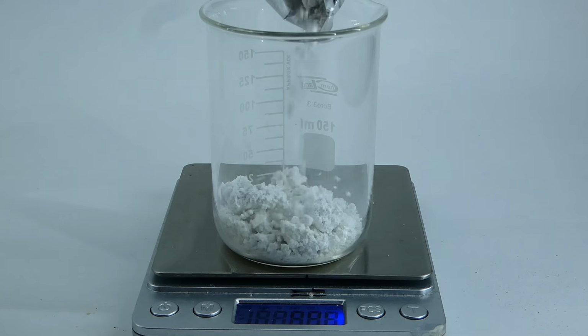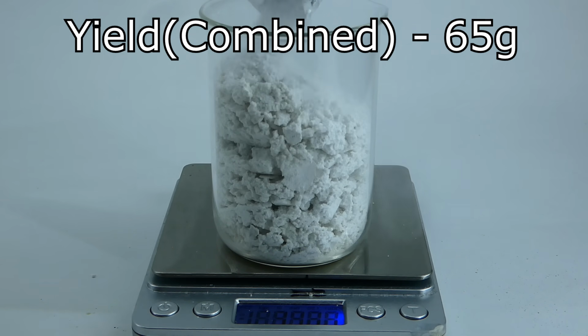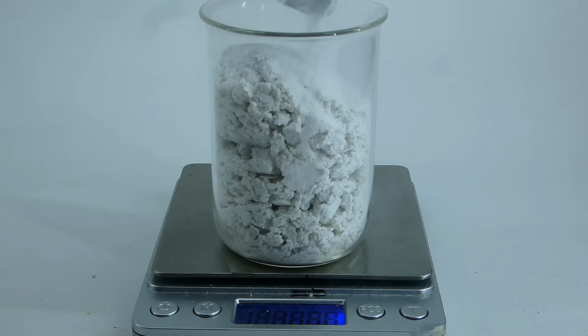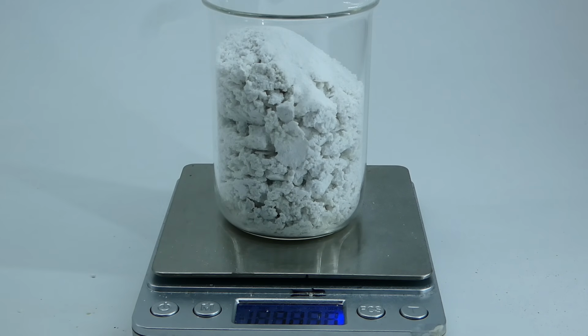After I processed all the silicate, I was left with a total of 65 grams of pure silicon dioxide, which wasn't a lot, but considering that I miscalculated the amount of sand that I had to use, and used around twice as much, this was actually a pretty decent yield.